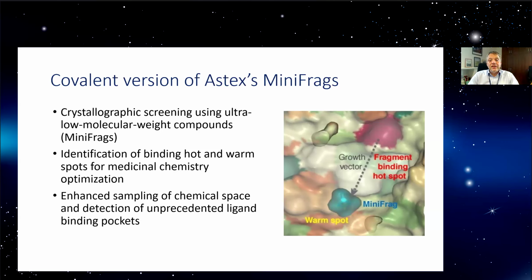So they are using these very small, ultra-low molecular weight compounds for X-ray screening. And they demonstrated that screening these very, very small fragments is useful to identify not only the binding hotspot, but also the warm spots as well that are located close to the hotspot.